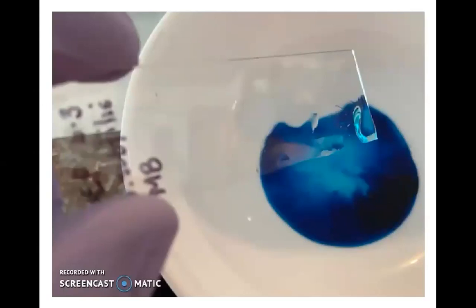Just one more word about stain. All of the stains that we use in the microbiology laboratory have to be disposed of correctly. They have to be collected into a waste container and treated as hazardous waste. So the reason that we work in these containers, these stain bowls or staining trays, is because we want to be able to collect this waste stain and keep it from going down the drain.